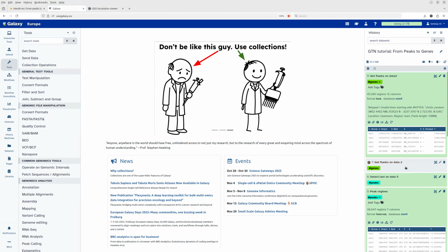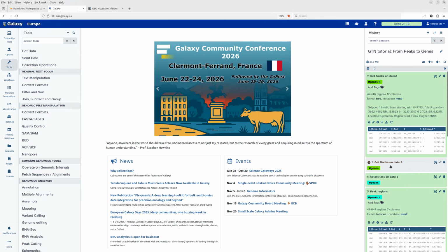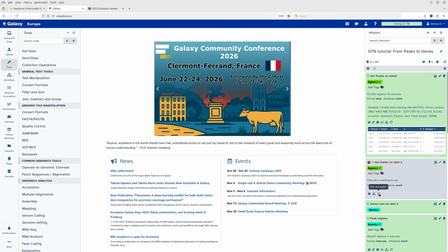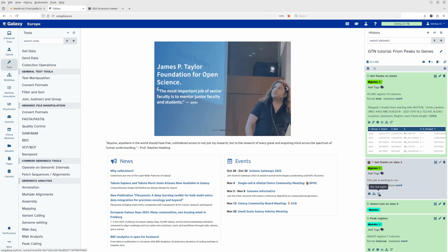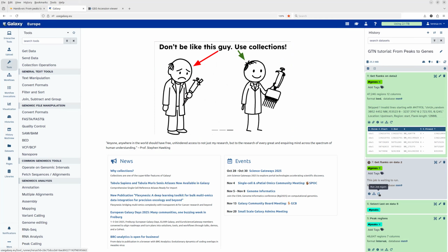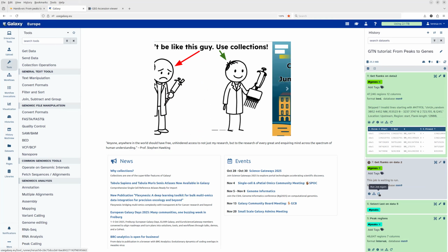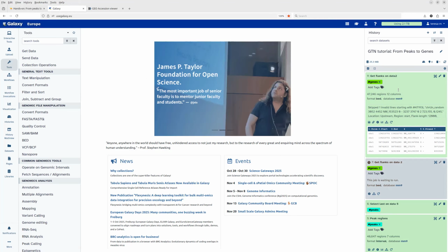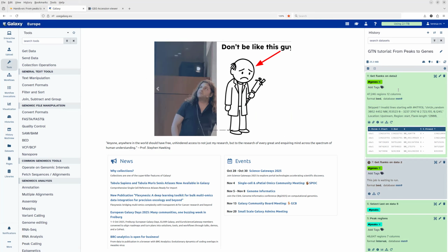So unfortunately, my job somehow got stuck, so it never started. What you can do in this case, you can try to rerun the job and just delete this one. It can happen from time to time, it's very rarely. But for the sake of time, I copied exactly this output file from a history I had pre-prepared, so we can continue our tutorial for today.